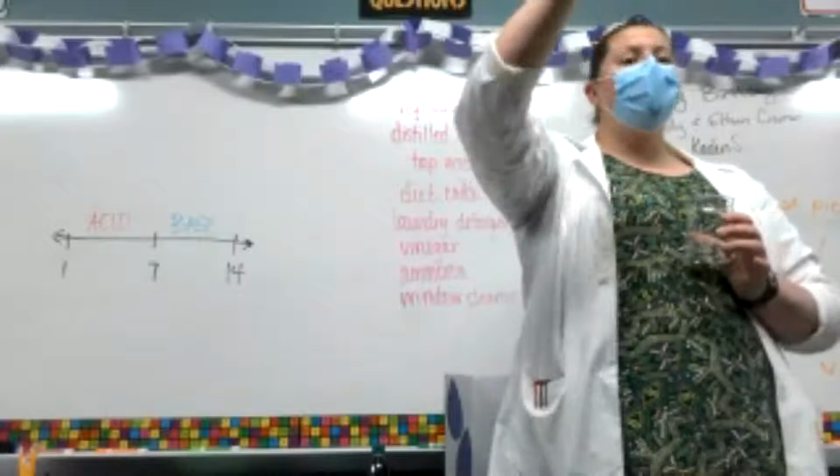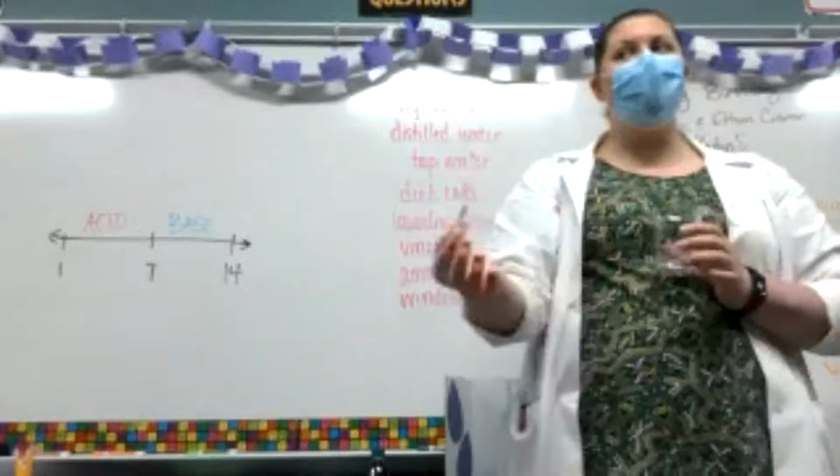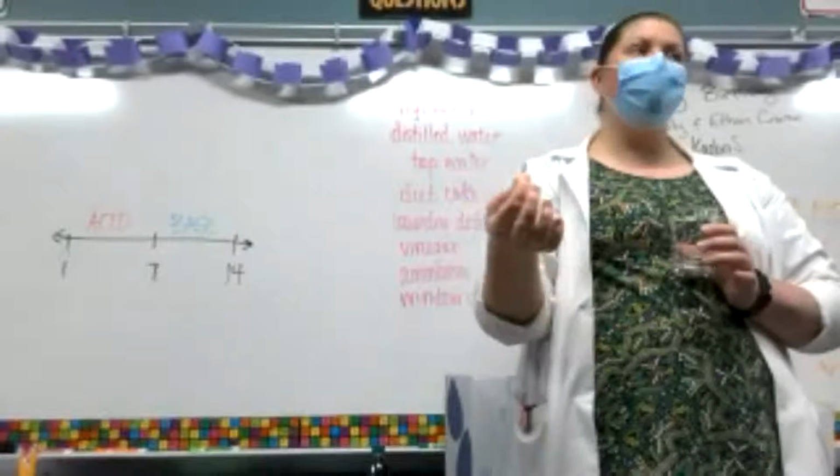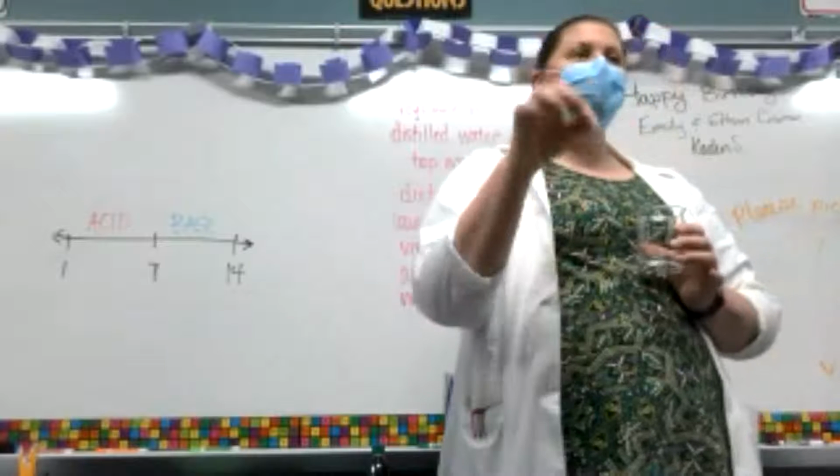Then after you dunk it, just lay it down on the paper at your station. It's okay to put them on there. We're going to throw it away when you're done because I've got more for later. And then just lay it down for now so that you can look at it later, okay?